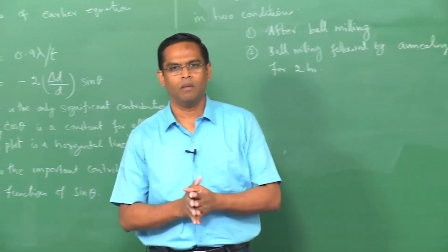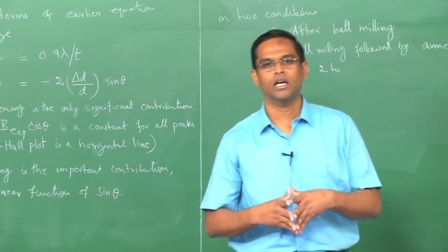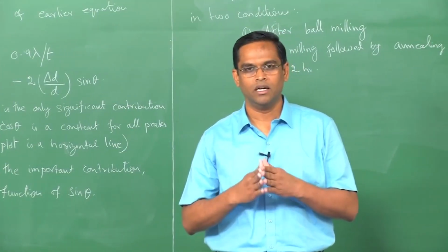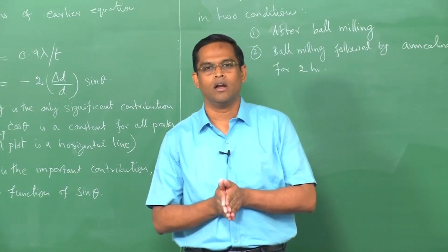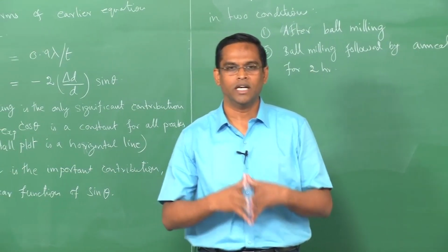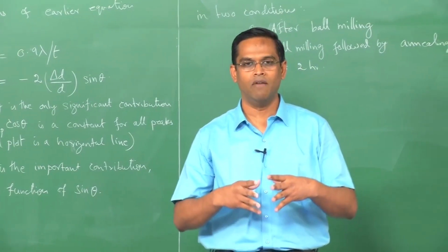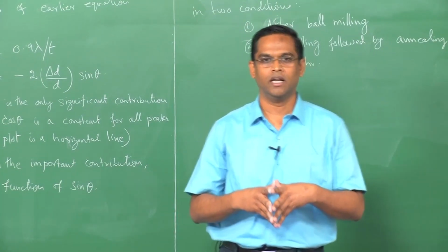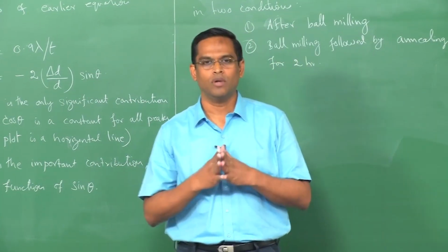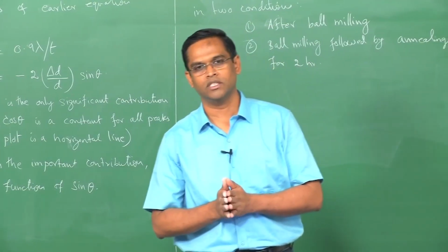And then other typical applications of X-ray diffraction include crystal structure determination, for which everybody commonly uses this technique, and also phase identification, for which X-ray diffraction is primarily used. Suppose you have a mixture of 2 or 3 phases in a substance, and you want to identify each phase; that is again a primary application of this technique.